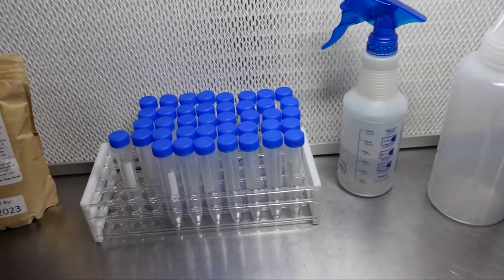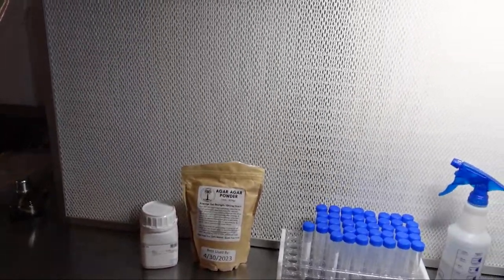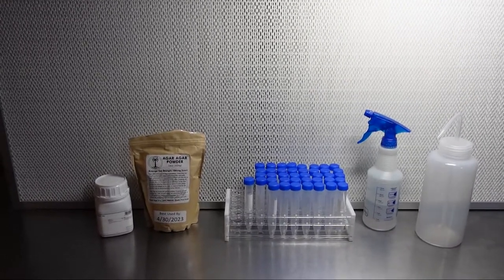To make agar slants, you'll need culture tubes with screw caps, agar powder, potato dextrose or some other nutrient, and a plastic dispensing bottle.